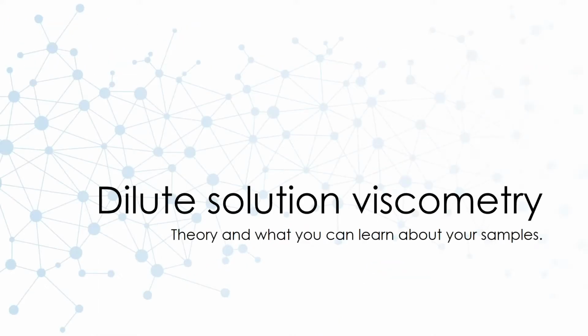Okay, so dilute solution viscometry. We're going to talk a little bit about the theory behind it, which is necessary so that we can understand what you're learning about your samples by doing these measurements and applying the theory to extract some of the parameters. As I mentioned earlier, a lot of these measurements are often referred to as intrinsic viscosity measurements, and that's one of the parameters you can extract from this. So we want to make clear what that parameter means and what it's telling you about your samples, in addition to some other parameters that we can extract.